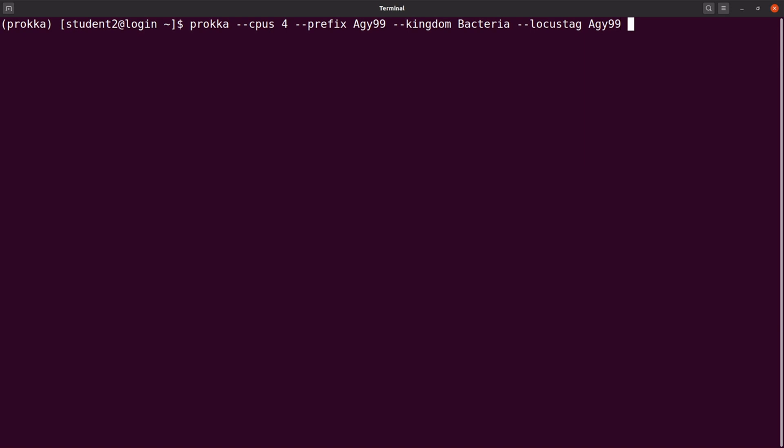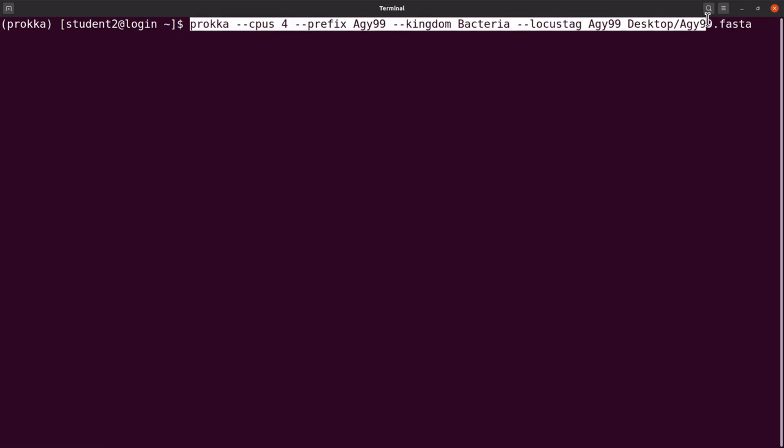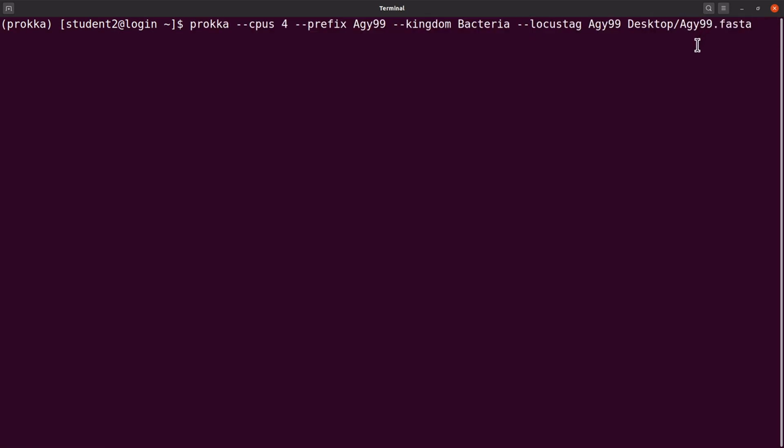So now we have it done, so it's now time to specify the file. We have to give the full path. So the sequence is on desktop and it's called agy99.fasta. So we have this file specified. So now we are ready to perform the annotation, but you can review your code to make sure that you have specified the correct options and have given the required information.